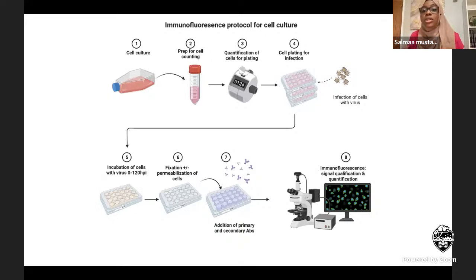Another thing that can help you jumpstart what you're going to start with is to go into the literature and see what's out there about the cell you're working with. Even though maybe you're working on Brucella and the cell line was used for a virus or another kind of bacteria, what you're concerned about is the cell. So you don't have to restrict yourself to a particular publication. And in the methods, there is often some missing information, like how many rpm you have to centrifuge the cells, or the incubation time. So we have standardized protocols, and I think this is the best.